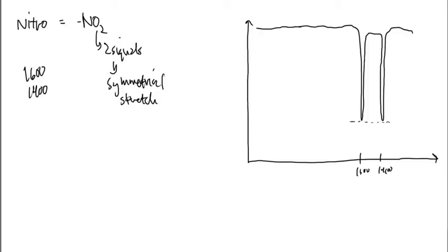That means they come down to about the same length when they do happen. And these peaks are very strong, which means they do typically tend to go all the way to the bottom when they can, and they are very narrow. They are not broad peaks like an OH would be or carboxylic acid would be.